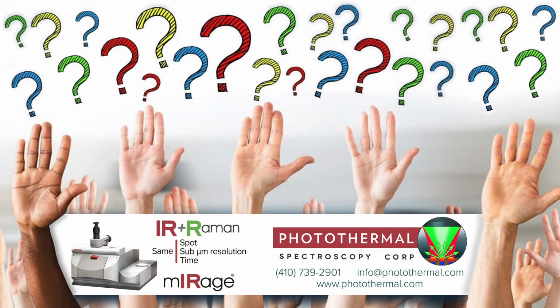Christoph, the next one I'll give to you is, do you see the possibility to do rapid bacterial ID at the single cell level? And will the natural cell-to-cell variability be an issue? Yeah, the classification model needs to consider the cell-to-cell variations. In our institute, we have a group that developed classification models to identify bacteria using Raman spectroscopy.